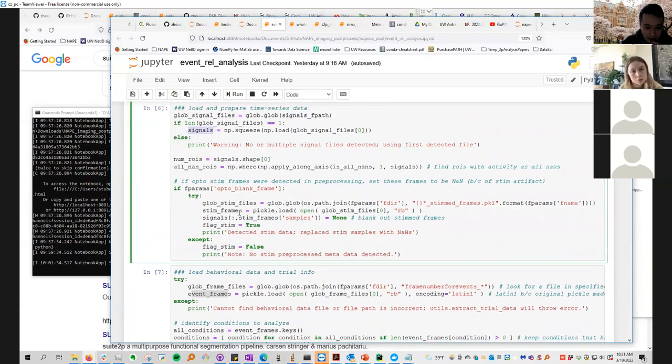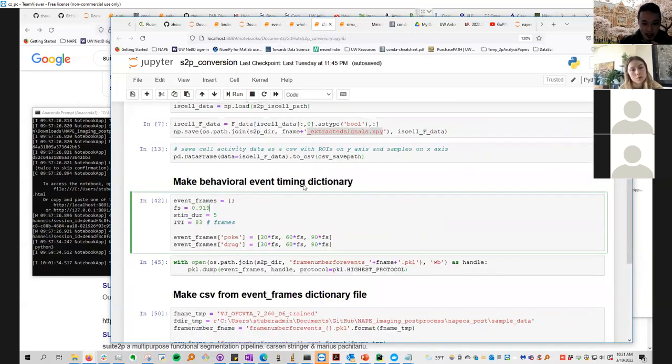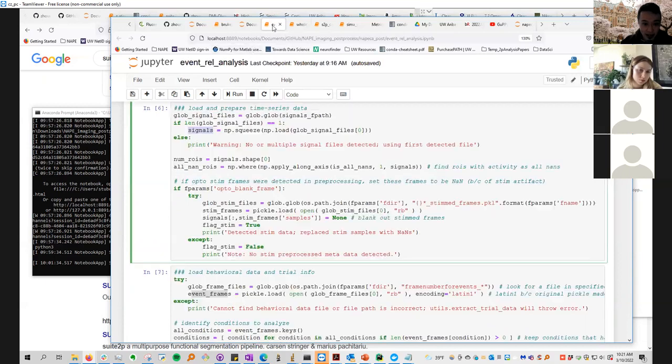So I showed you all these conversions of the output from the pre-processing pipelines. What I'm working on is a way to just input Excel sheets or CSV files directly into this, so that you don't need to do some Python coding to convert.